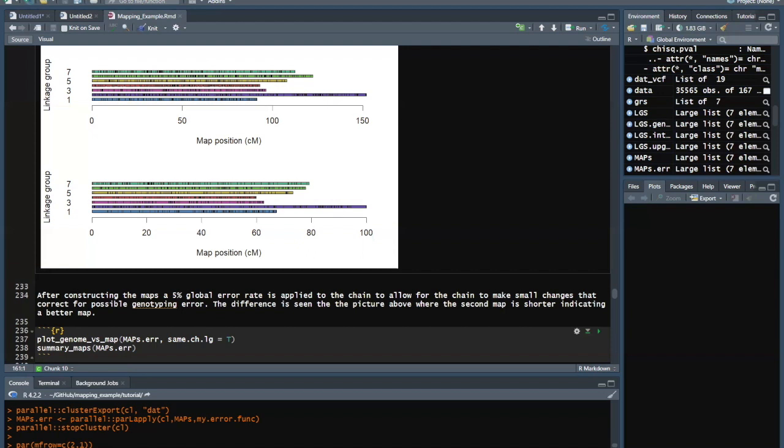So for MAPpoly, how it's written, if you use it like it's supposed to be used, you have to give it a sequence, an a priori sequence first, and then you give it a 2-point, and it tries to put the markers in that order. If it can't put it in that order and it doesn't match the phase, it's going to kick out that marker, and it won't be included. Yeah, you are thinking the probability that two markers are incorrectly ordered is really low, or no chance.